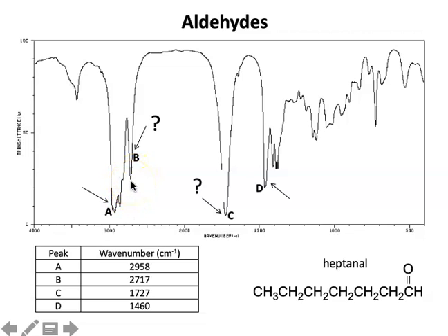By the way, in your lab, I included a correlation chart that includes all kinds of detail. And another thing which is really helpful for you guys to do is to develop your own correlation chart. In other words, your own little IR spectra that you highlight certain areas of.